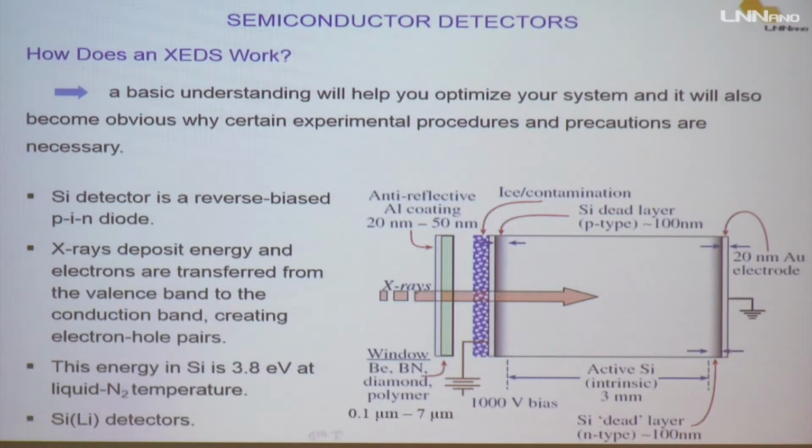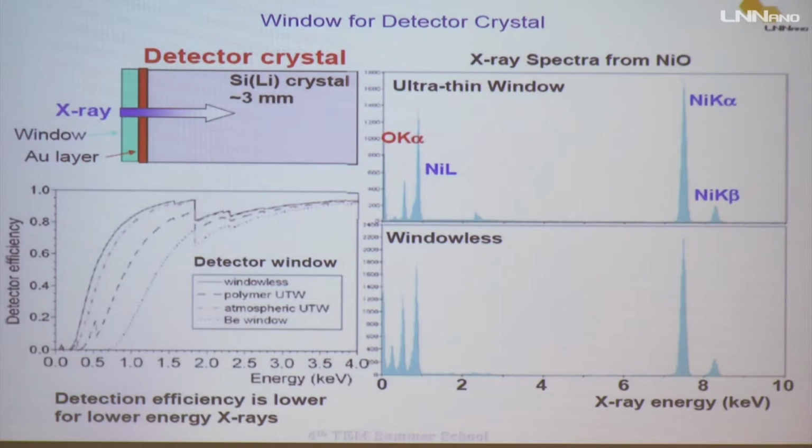And then this voltage will be identified to some specific energy of the incoming X-ray. Okay? It's very simple. Well, let's continue here.